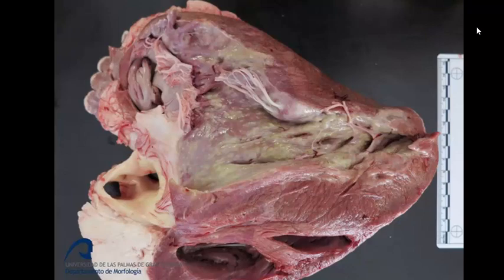Number C was Cysticercus bovis. Cysticercus bovis is a tapeworm which the ox is the intermediate host from. If you see them acutely, you will see classic cysticerci or bladder worms scattered throughout the heart and some skeletal muscles, especially the metabolically active ones of the jaws. You can see them in any skeletal muscle, but it really likes ones that are metabolically active, and the heart's always beating. Later on, they will die, they will mineralize, and it will look like little holes in the myocardium.